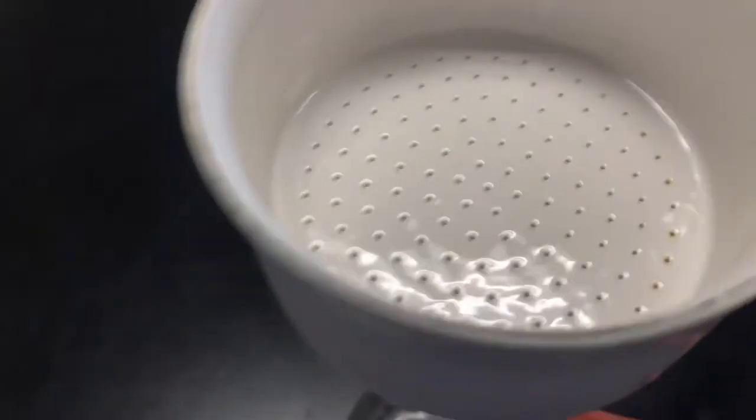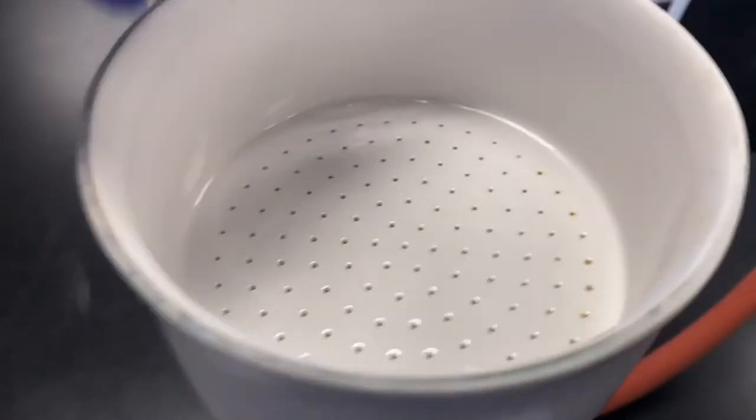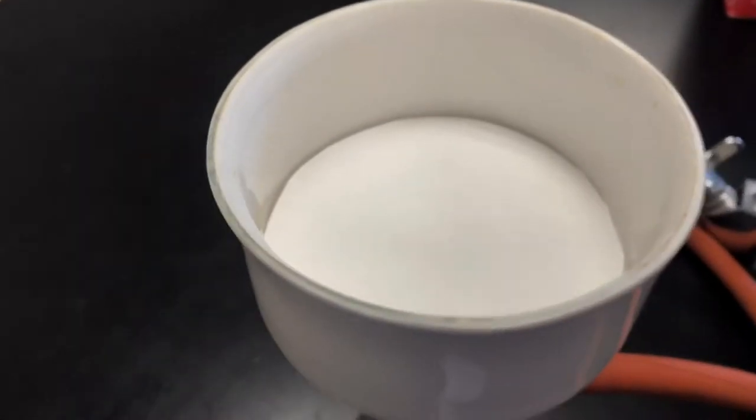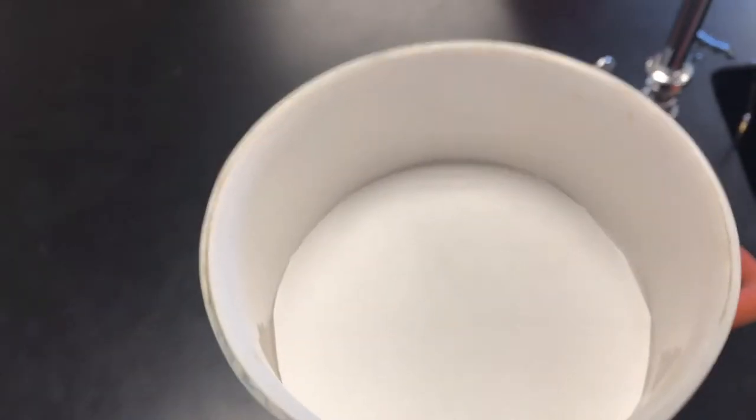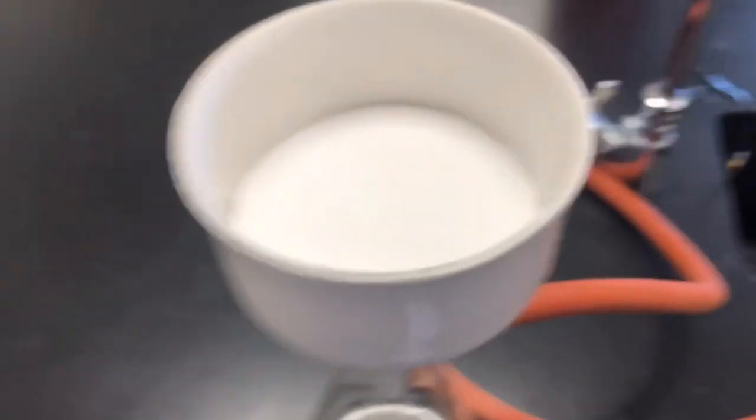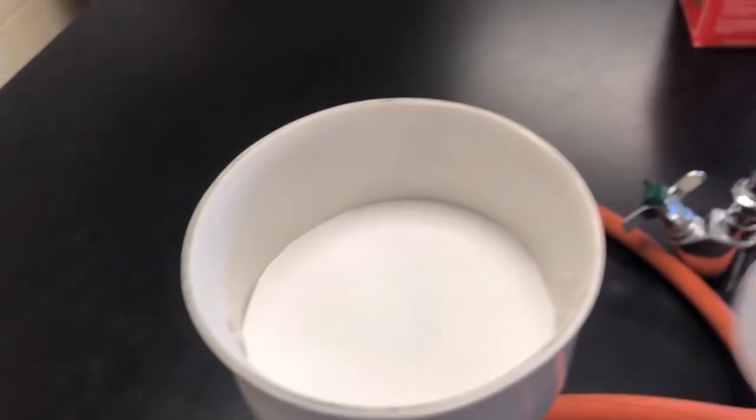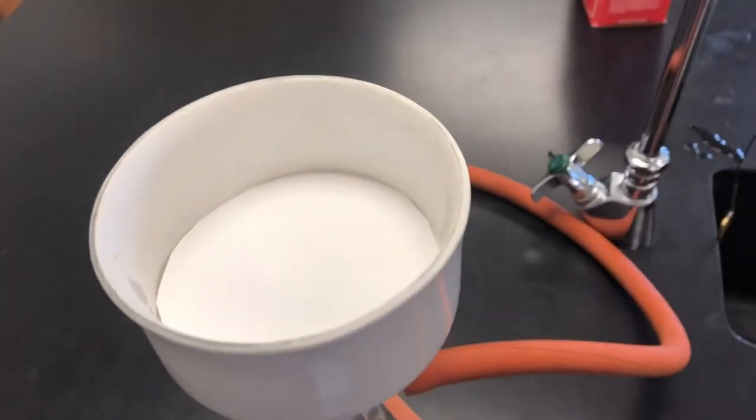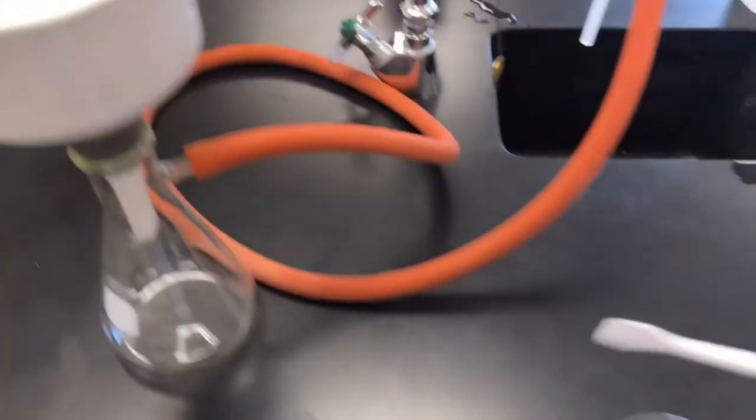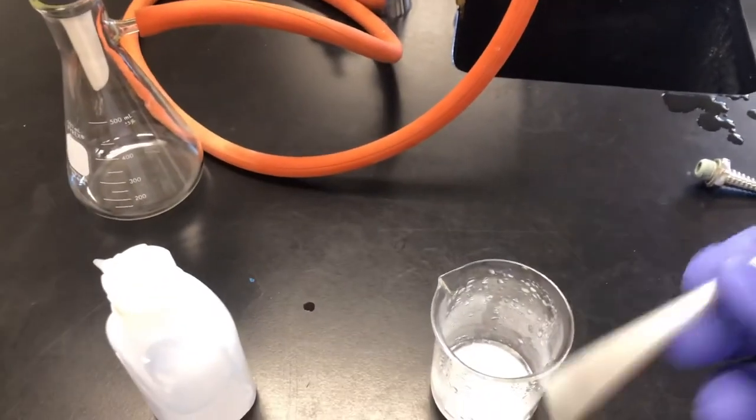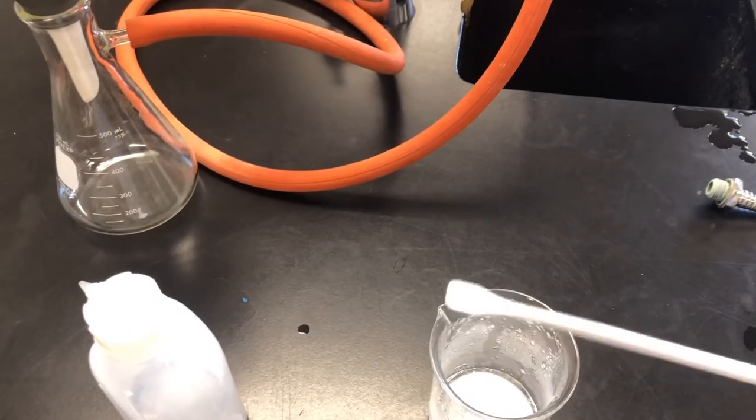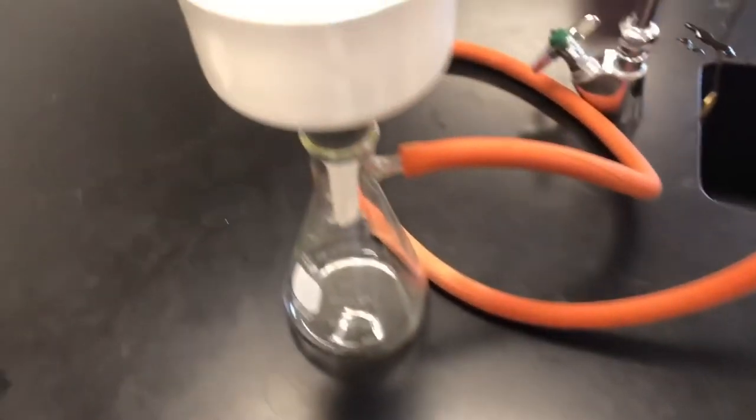Then we have this rubber piece that's going to make a nice airtight seal between this and the porcelain Buchner funnel. The Buchner funnel is porcelain and it has all of these little tiny holes. So whenever we put our filter paper in there it will pull the liquid through this very quickly.